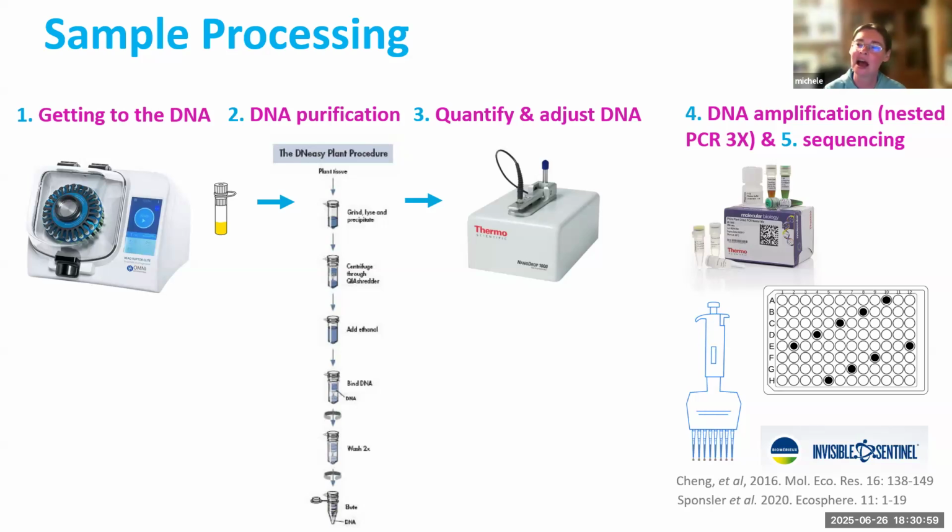And then the last step, because I know there's a lot of steps with this: once I've done my rounds of photocopying, I clean. Yeah, you have to clean everything, right? I feel like you're never going to escape from cleaning. But I clean that reaction up and I send it to a facility in Philadelphia that performs something called Illumina sequencing. Illumina sequencing essentially will take all that environmental DNA, amplify it one more time, and then pull down the information from that DNA, which they then send back to me.